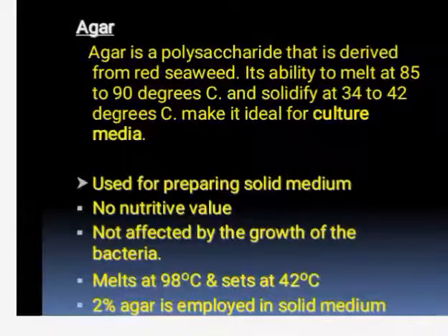It has no nutritive value, and is not affected by the growth of the bacteria. It melts at 98 degrees Celsius and sets at 42 degrees Celsius. 2% agar is employed in solid medium.